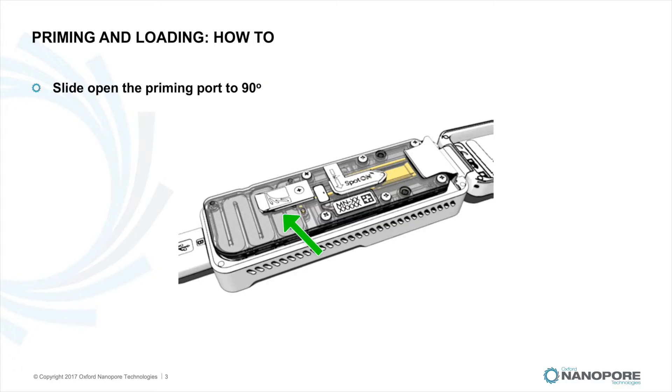Slide open the priming port cover to reveal the priming port by turning the cover 90 degrees clockwise until you hit a bit of resistance. This ensures the valves are fully opened. Do not try and turn it more than 90 degrees as this could damage the port and valves.